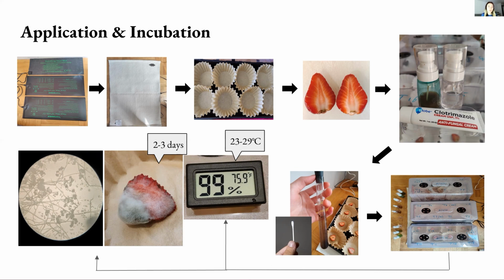After 30 minutes incubation at room temperature, each strawberry was inoculated with fungal spores using a mixture of tap water, mold spores, and soil from my backyard. I dip a Q-tip in the dirt water suspension and wipe across the cut surface of the strawberry halves.